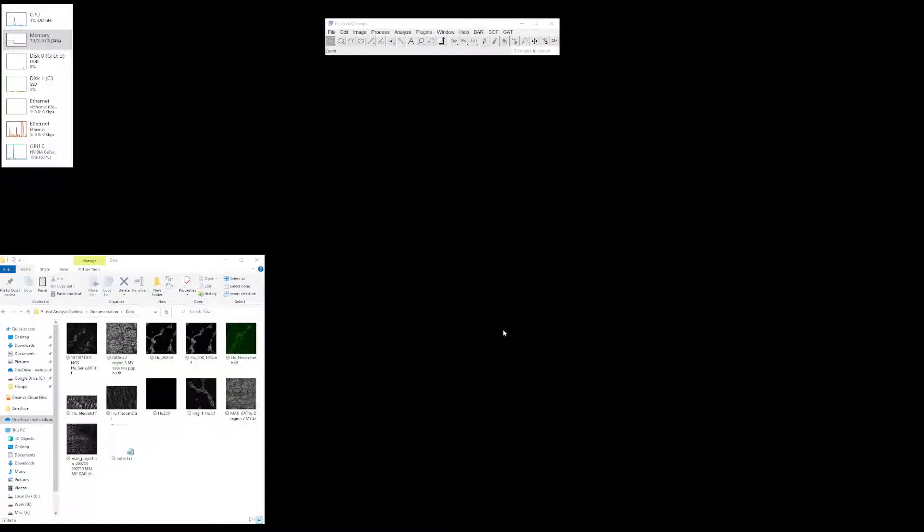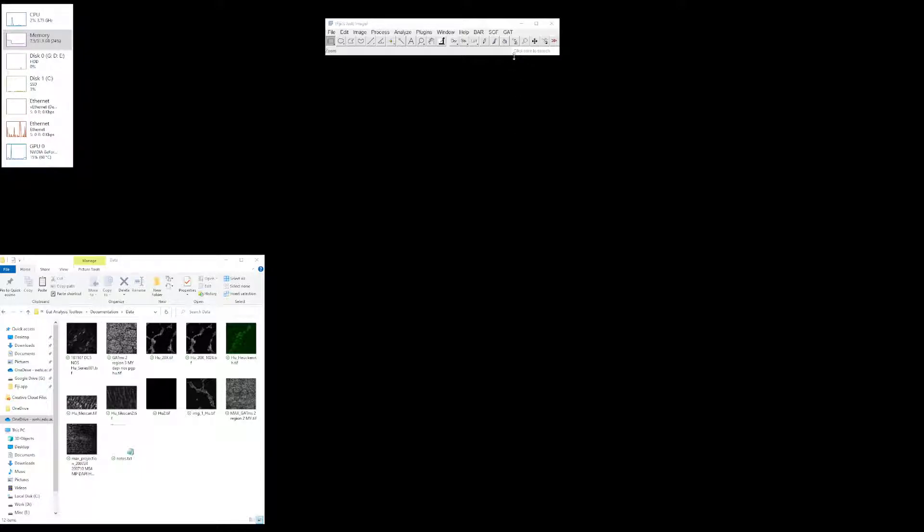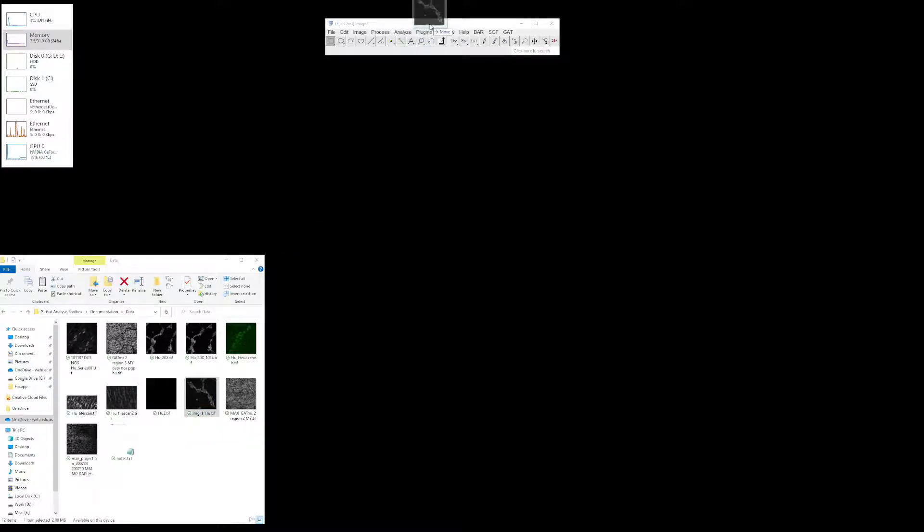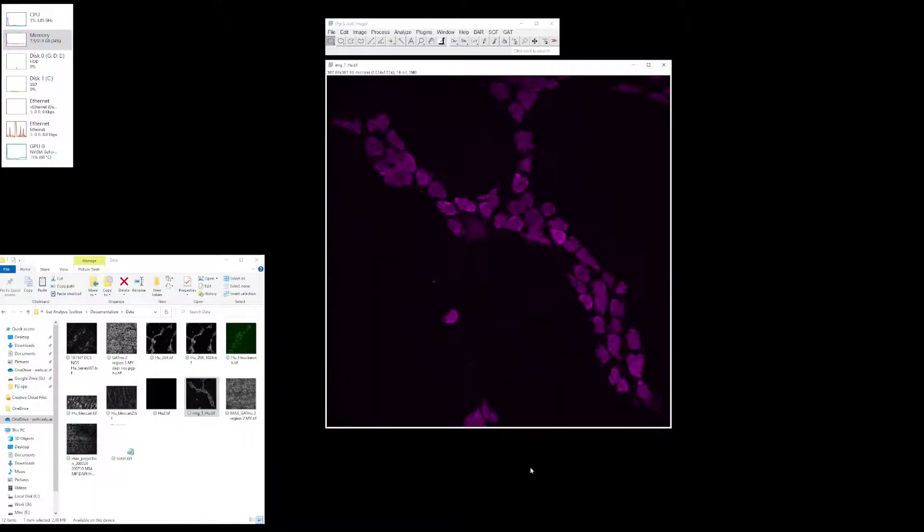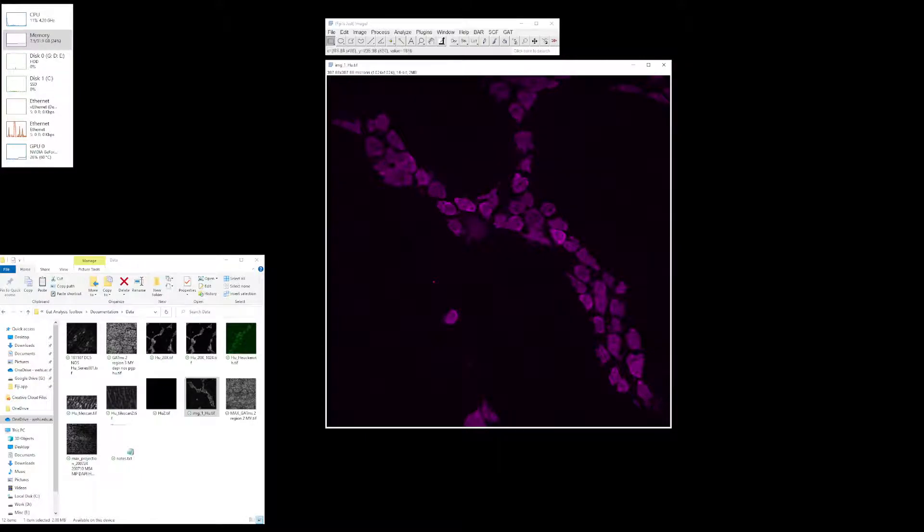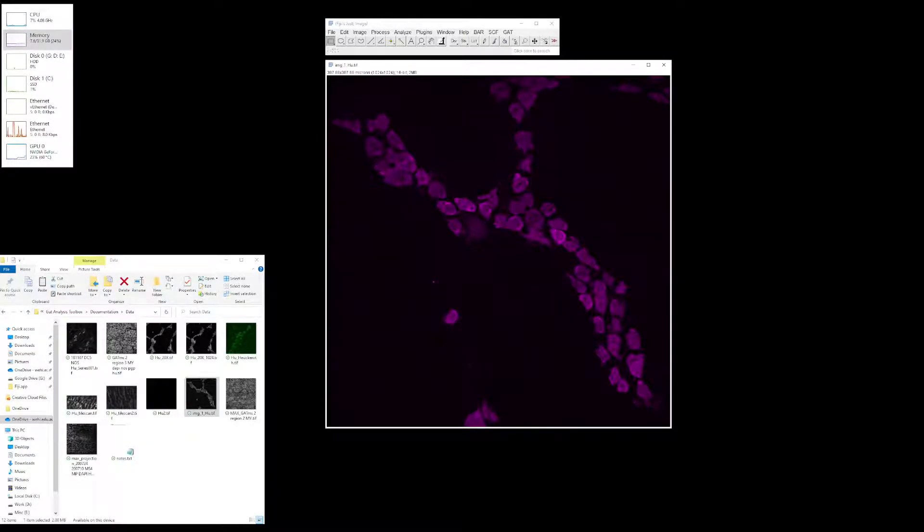I will show you how to use Gut Analysis Toolbox, or GATT, for segmenting neurons. This is based on the assumption that you are using Hue, a pan-neuronal marker for labeling the enteric neurons. Start off with a 40x image. This is from mouse tissue where the neurons are labeled with Hue and acquired in the 647 channel.